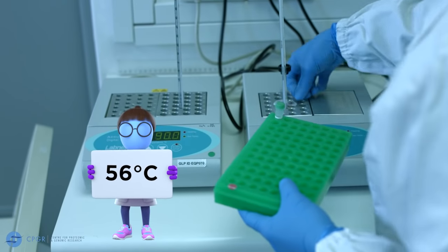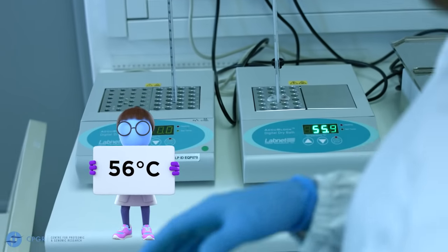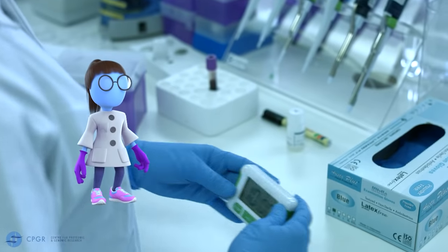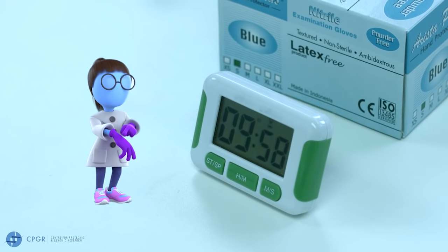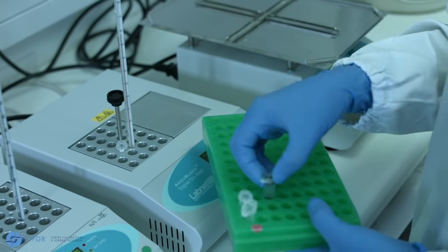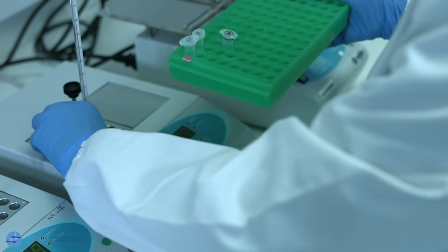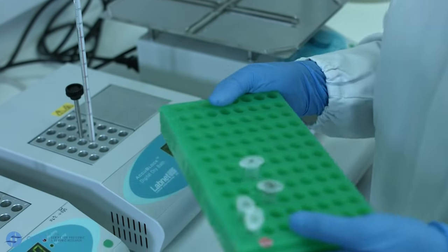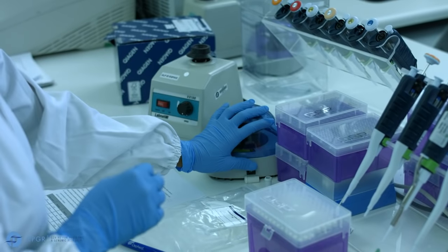Transfer the microtubes to the heating block that has been set at 56 degrees centigrade and incubate the samples for 10 minutes. At the end of the incubation period, remove the samples from the heating block and briefly centrifuge to remove any droplets from the lids.